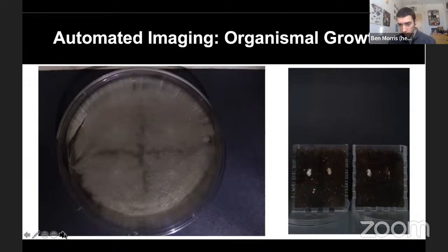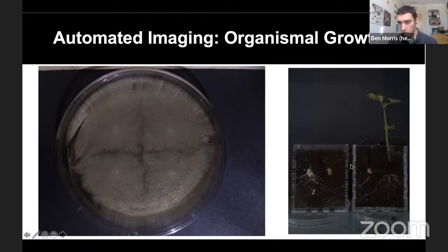On the right, we did a very similar experiment, but growing beans in these clear plastic planters. So we made these planters with the help of Eamon McMahon, who's the scientific machinist at Middlebury, but you could easily do it in commercially available planters as well. But what this really was fun for us and allowed us to do was visualize both the root growth under the soil, because we could put the seeds right up on the edge of the planter, and then also see the plants actually growing. We're not plant biologists, so our plants didn't always grow, and we probably could have had slightly better growth conditions, but we got some fun videos out of it.